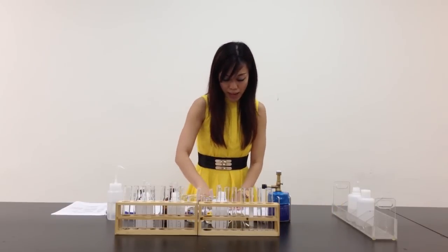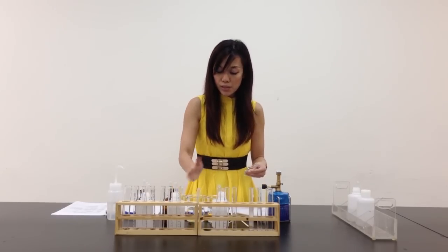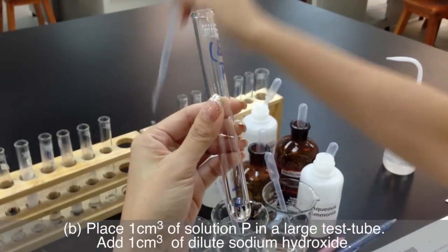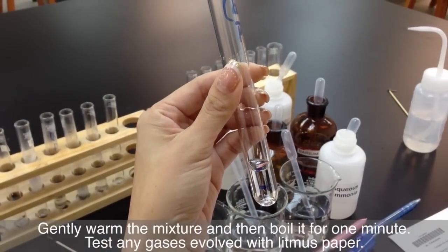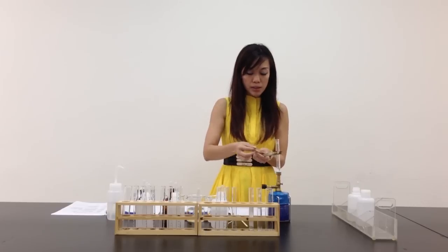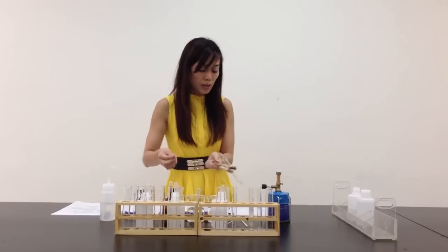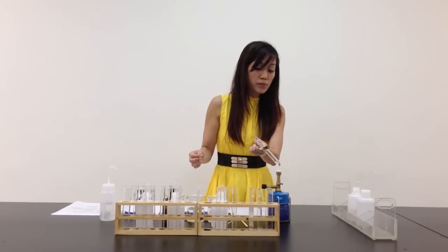Let me move on to Part B. It says I'm supposed to add 1 cm³ of solution P. I have P, Q, and R in front. I take 1 cm³ of P — I have already marked the level during preparation time — and another 1 cm³ of sodium hydroxide. I'm supposed to gently heat the mixture and then boil it for 1 minute, and test any gas evolved with litmus paper. Dry litmus paper has no use — it does not react with any gases. So I dampen it with distilled water.